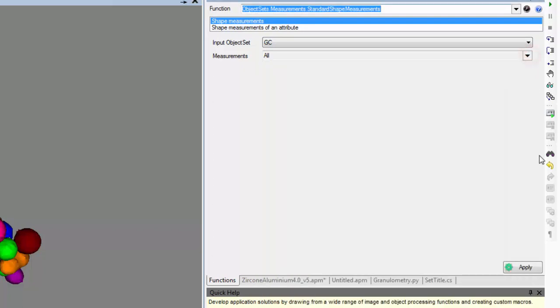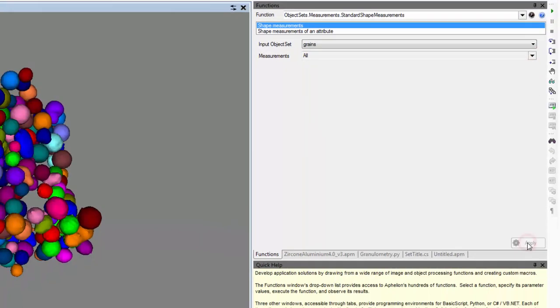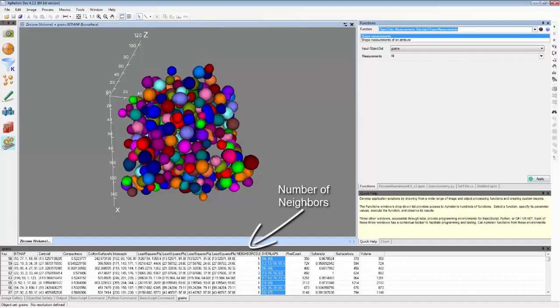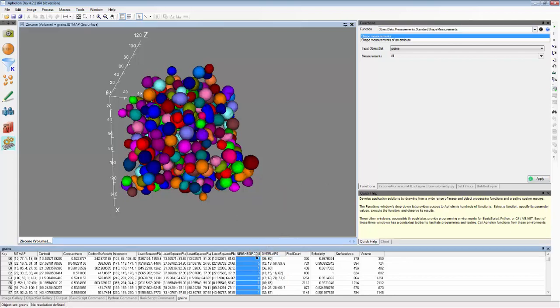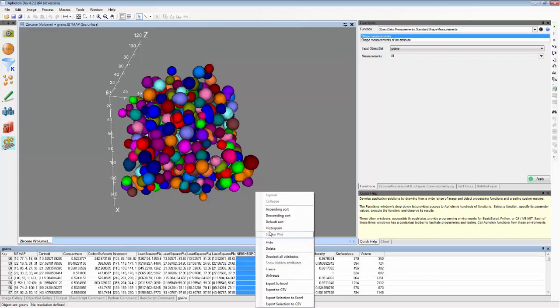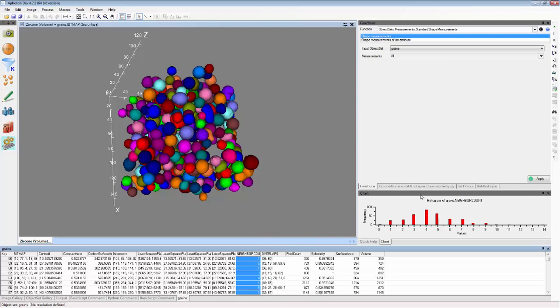These results can then be displayed as a histogram for a property of interest such as the number of nearest neighbors by selecting that property in the grid view and then selecting histogram.